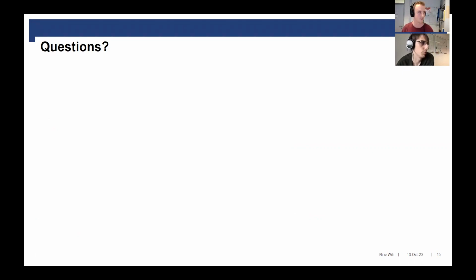We have one question already from Kevin von Witter, who's asking, what does high Q mean when you're referring to EPR resonators? I think it's a few thousand, if I'm correct. I guess it depends a little bit on what Q you have, but I'm not doing a lot of CW, so that's what I have in my head. So it's very narrow. But I mean, you cannot do any pulse EPR with a CW resonator. Basically, you have to do the coupling very differently.